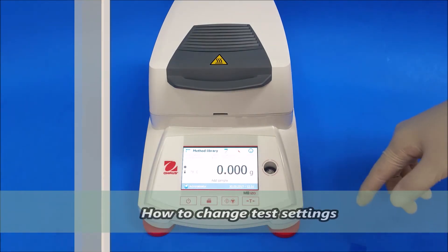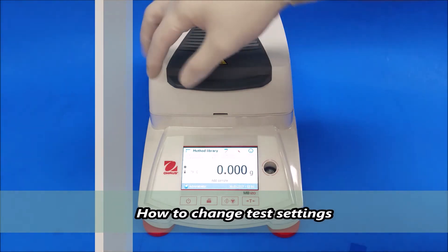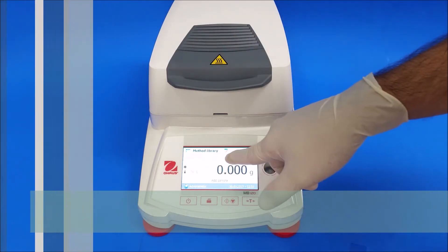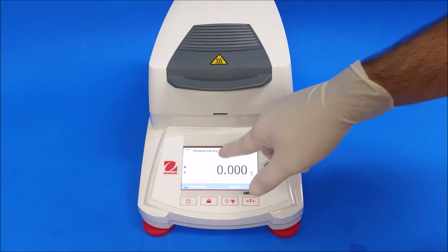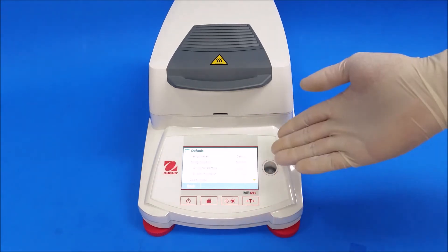And if you guys want to change the test settings, you should go where it says current method, default, drying program, standard. Just click on this whole line here and it should give you the settings.